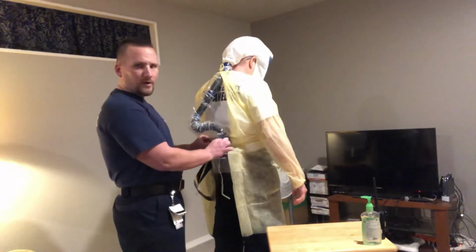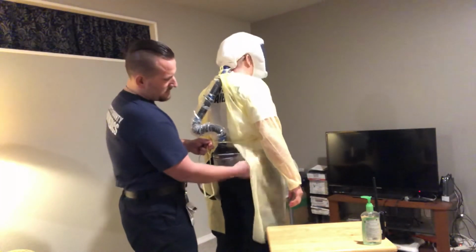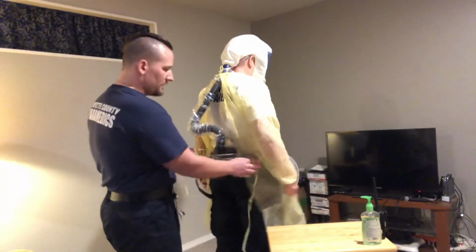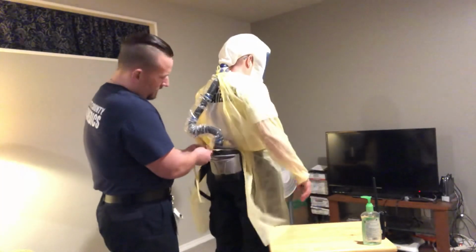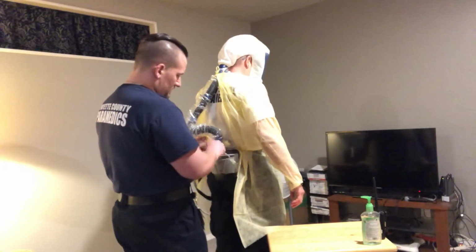Want me to tie you? Yeah. All right. Gotcha. No problem. So we're gonna tie it over the unit, right? So basically we're gonna, as best we can, even though we're gonna have to access it, it's best to just try to keep some kind of coverage over the unit itself. Okay, oops, sorry, I lost you. There you go. So just tie right over the hose here. Not too tight, nothing like that, but you know, make it stay.